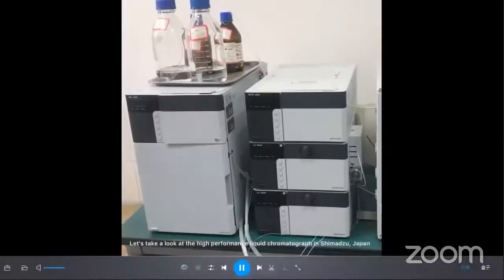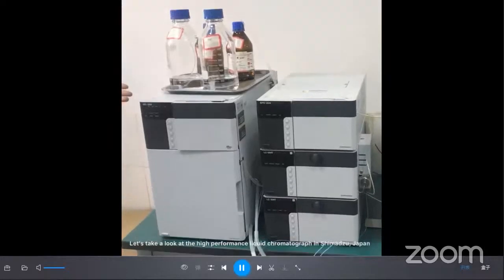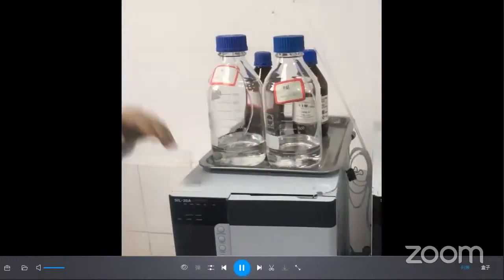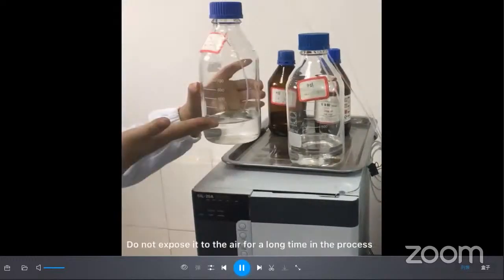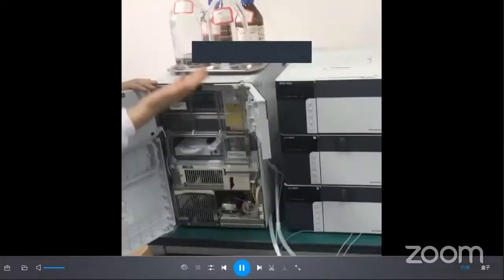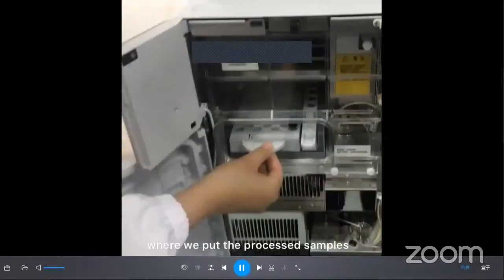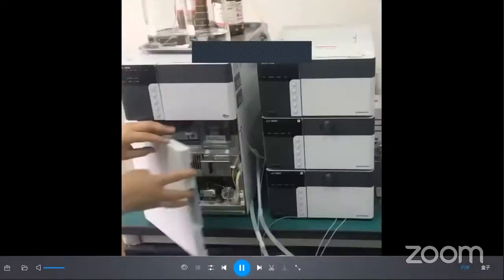Let's take a look at the high-performance liquid chromatograph in Shimadzu, Japan. First, on top of the tray are bottles containing water and organic phases. There is a suction head inside the bottle to suck up the solution. Do not expose it to the air for a long time in the process. And down here is the automatic sampler, where we put the process samples. Here is the position of the 6-way valve.